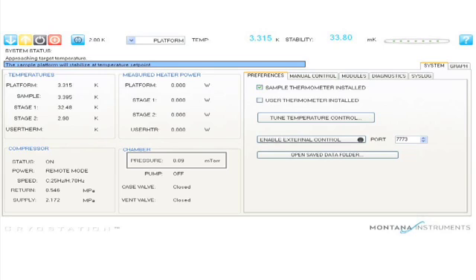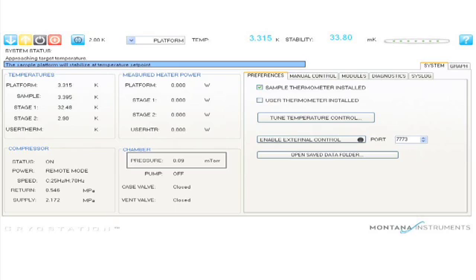The pressure will reach 0.09 millitorr right around the time when the system reaches the base temperature. This is the lowest that the pressure gauge will read, but note that the pressure is much less inside of the sample chamber and it's really on the order of 10 to the minus 7 torr.